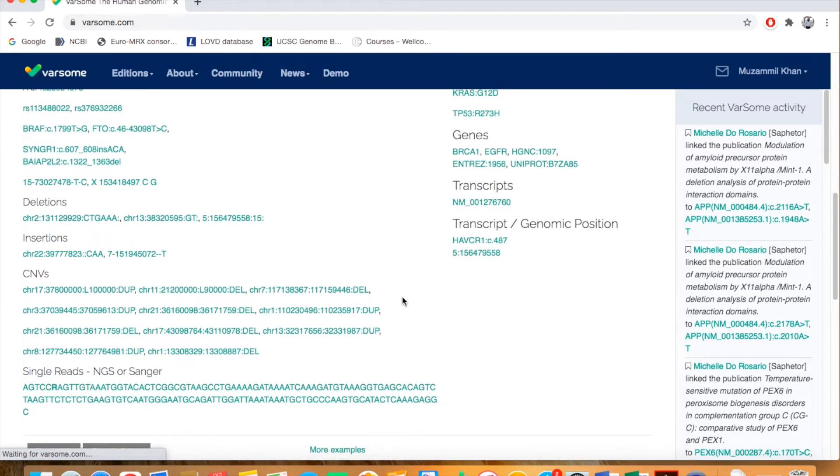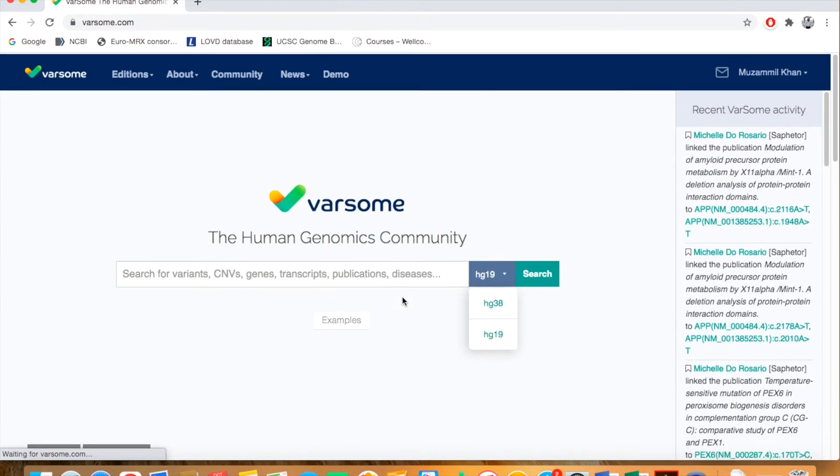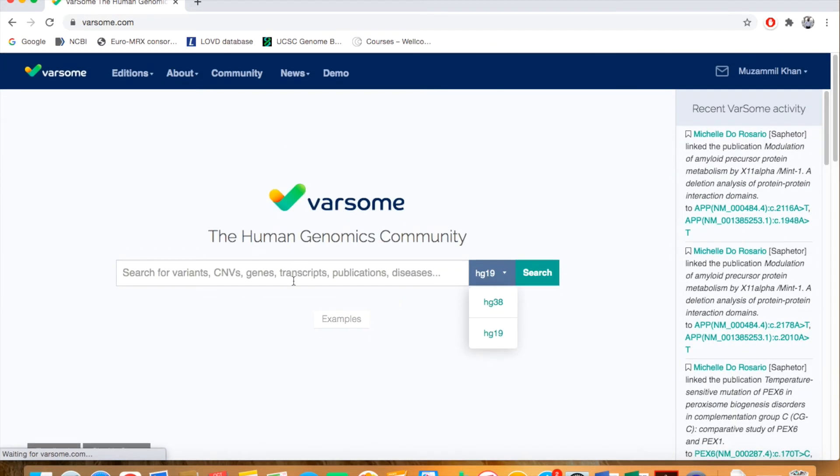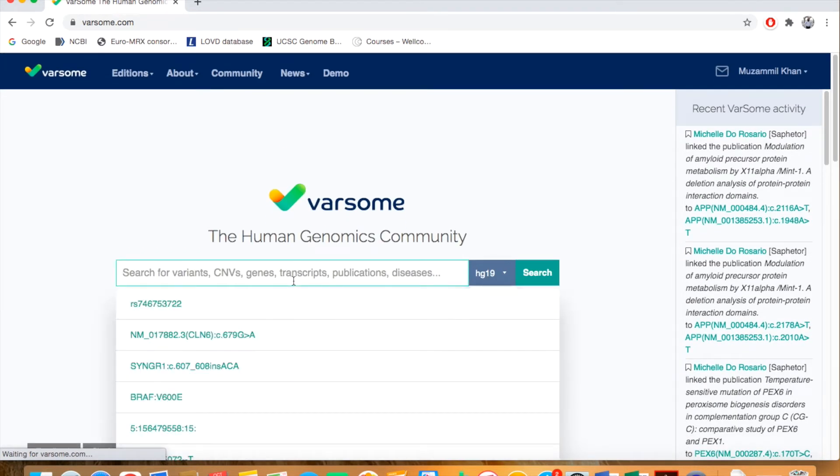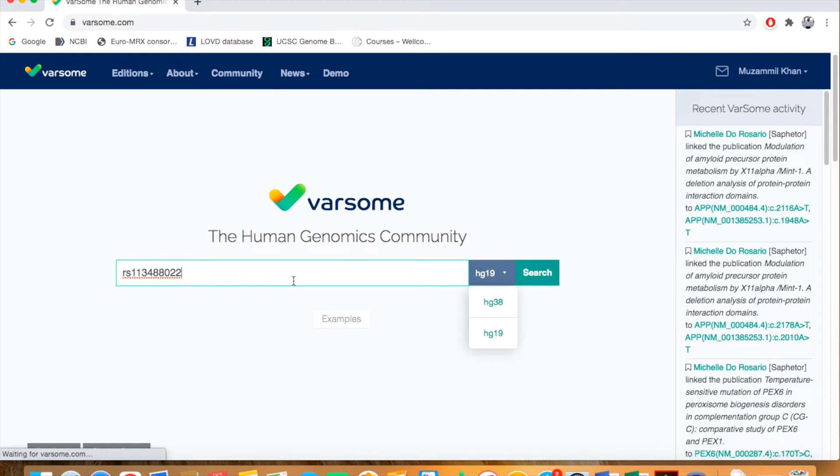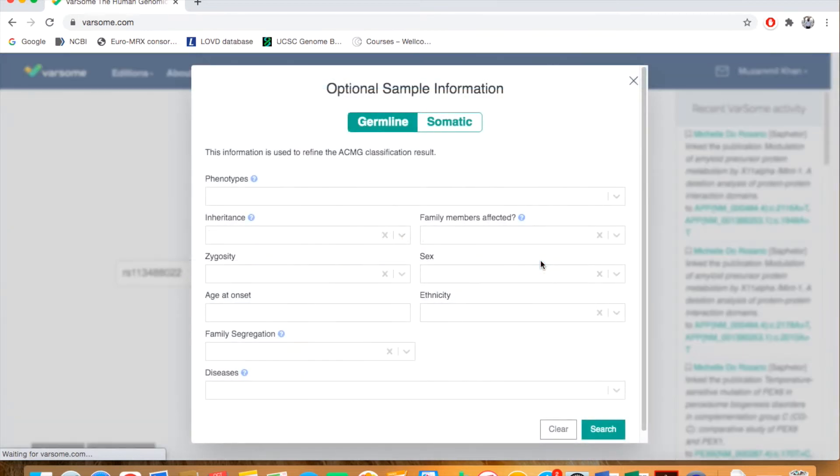Just put in here, for example, this SNP, select HG19 assembly, and click on the search button. If you know further information about this variant, the phenotype found in the patient, you can provide that information.